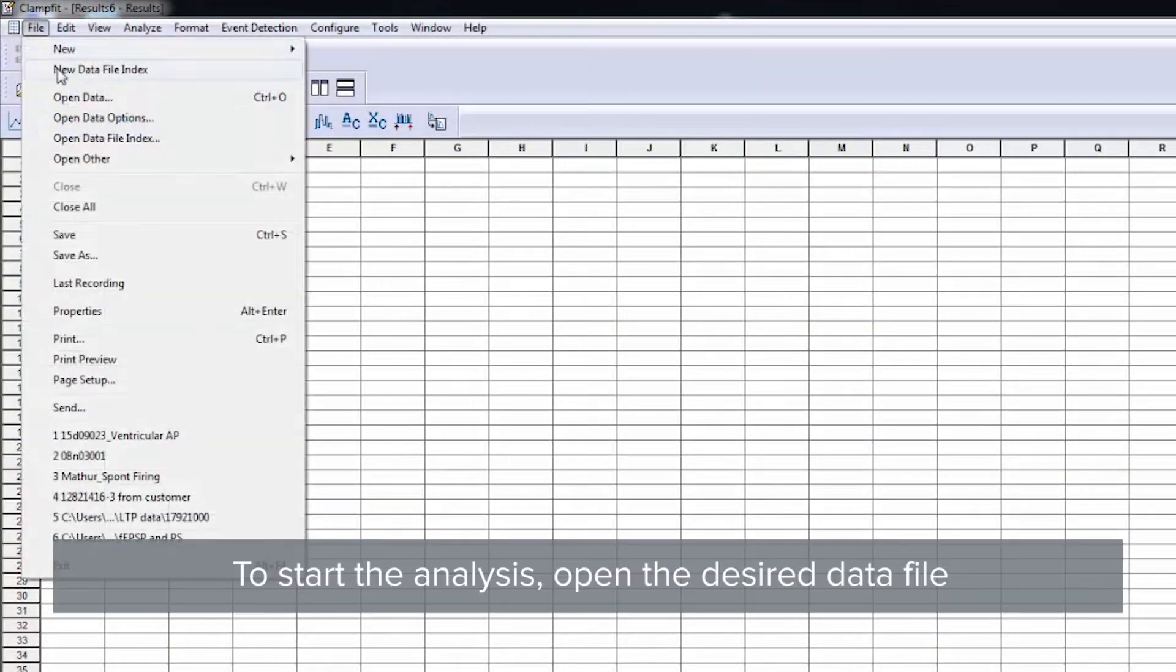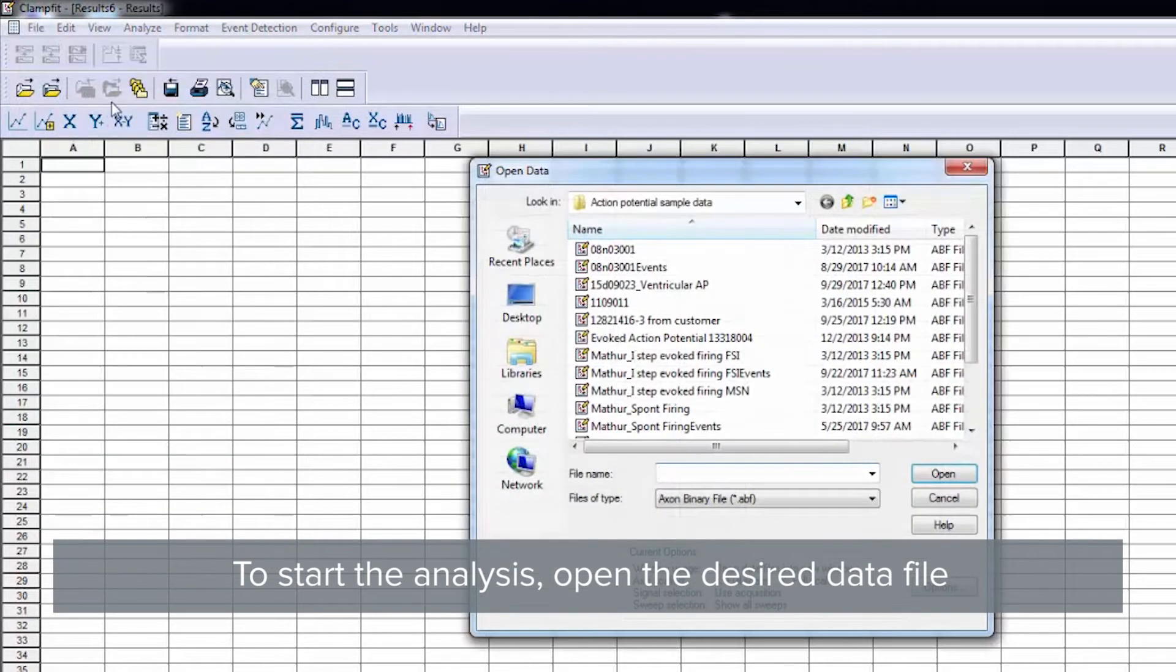To analyze the neuronal action potential, first open the desired data file in the File tab.